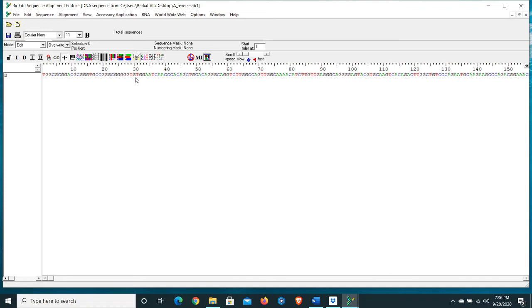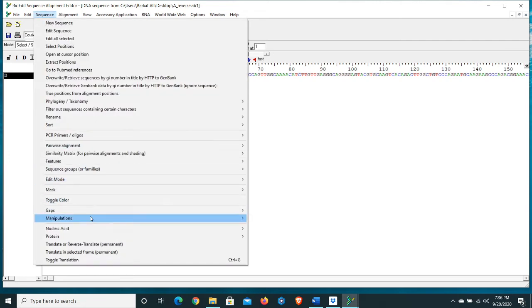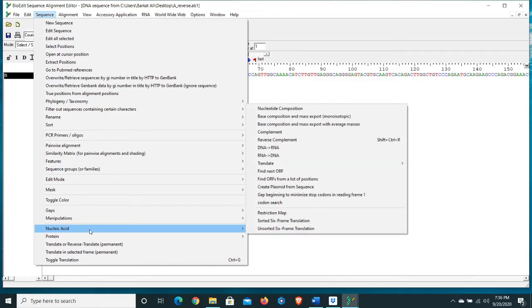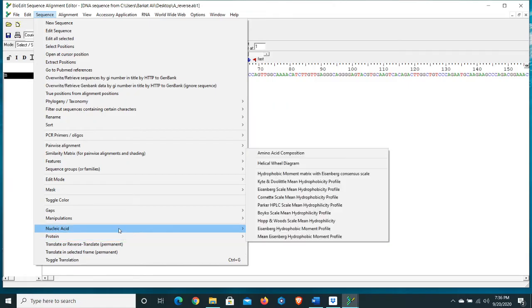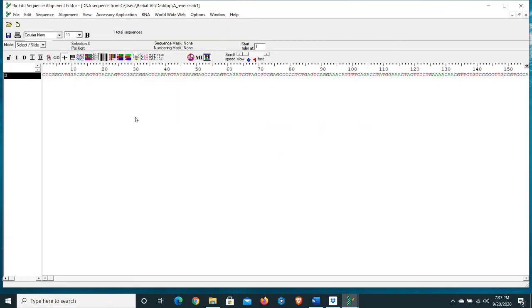After that you need to make the forward sequence parallel in direction with the reverse sequence. For this purpose we need to use the Reverse Complement option to make both sequences in the same direction. Select the slide, then select the sequence name. From the keyboard press Ctrl+Shift+R, or go to Menu > Sequence > Nucleic Acid and select Reverse Complement. Click on it — now you can see our reverse sequence is converted to reverse complement.